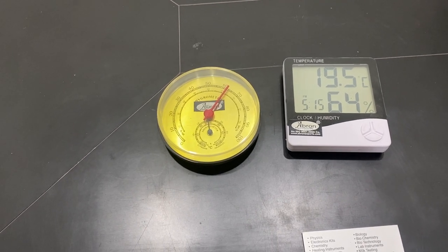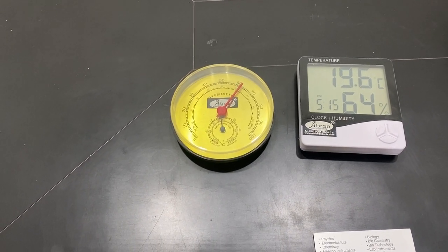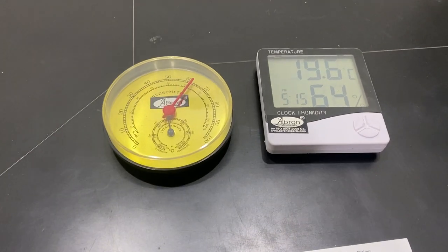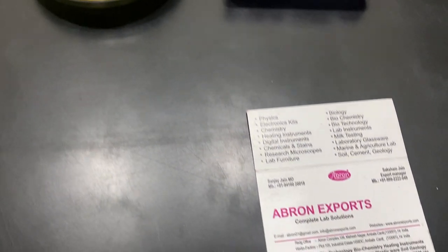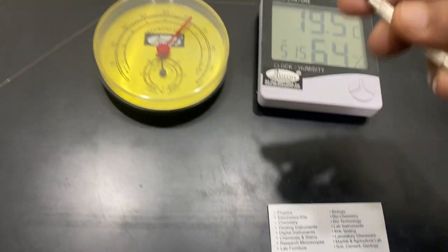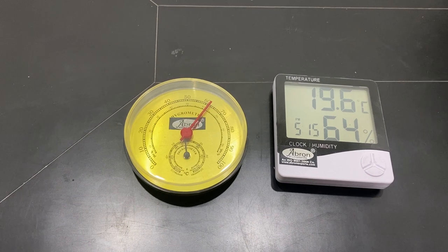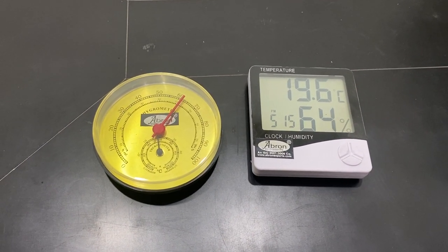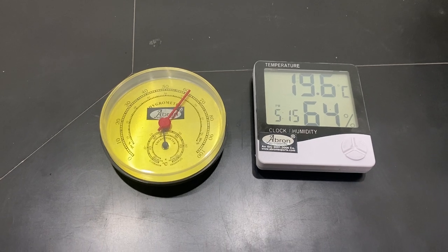Bear in mind, dial-type instruments were earlier used continuously in all labs, but nowadays digital ones have also come up. The dial type is not a highly accurate instrument. For accurate calculation and calibration, digital instruments are available, and many other instruments have come on the market. Visit our website — thank you very much.